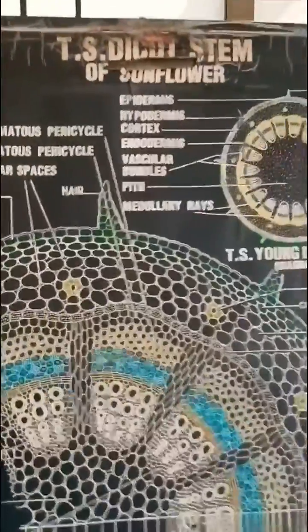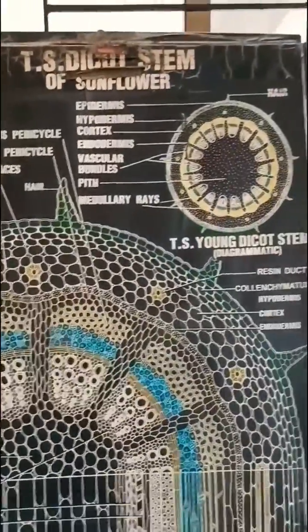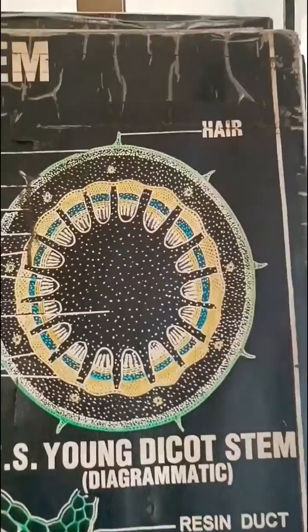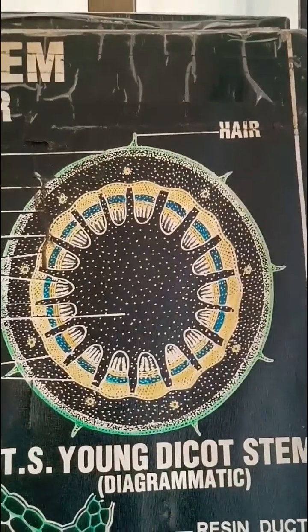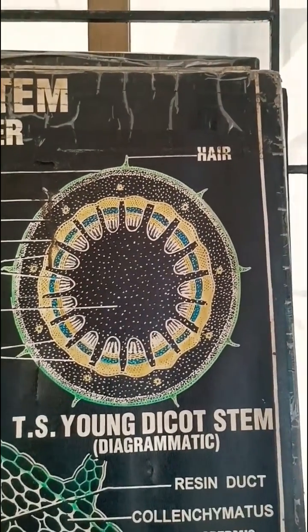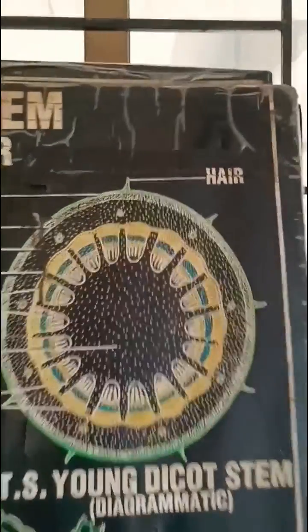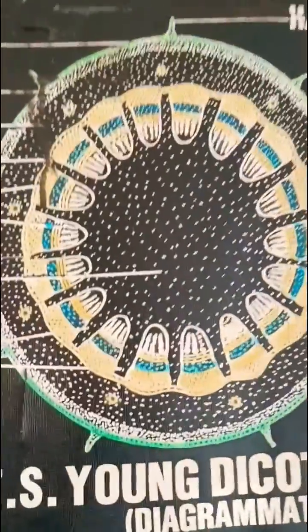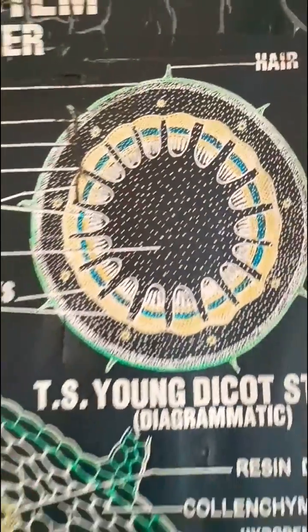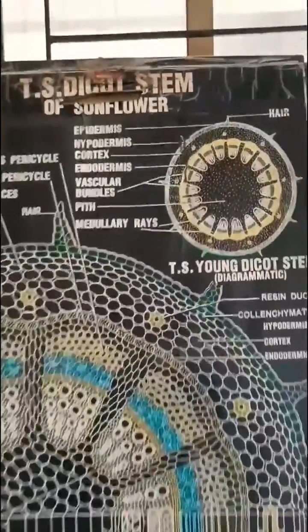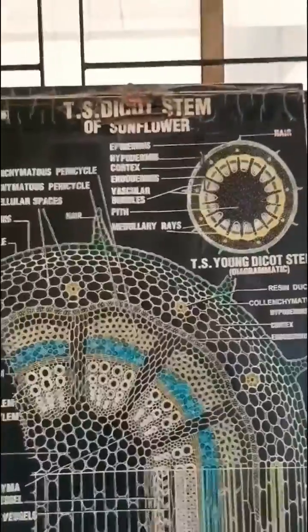Whereas in dicot stem, the vascular bundles are arranged in a ring. You can see here the vascular bundles are arranged in a ring, and that's why it is dicot stem. So in monocot it is scattered; in dicot the vascular bundles are in a ring.